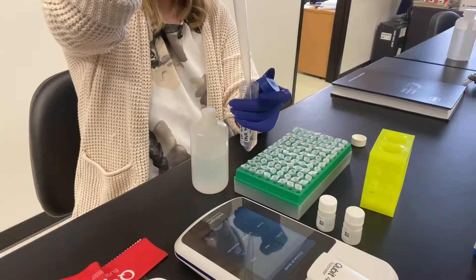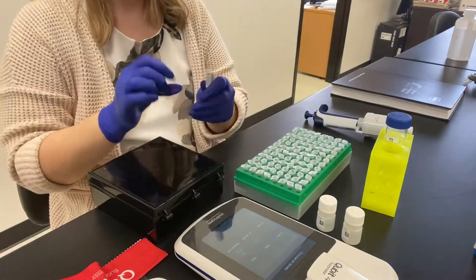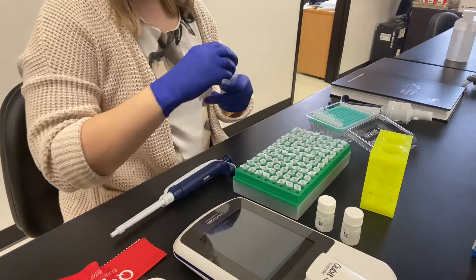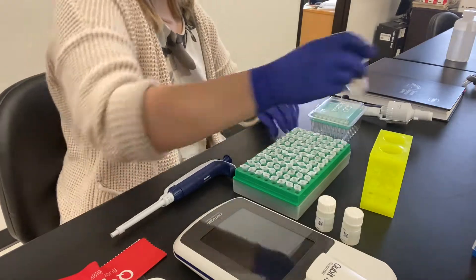Next we'll make the 1 to 200 reagent-to-buffer working solution, immediately replacing the reagent back into the black box to prevent exposure to light. Gently invert to mix and your working solution is ready.